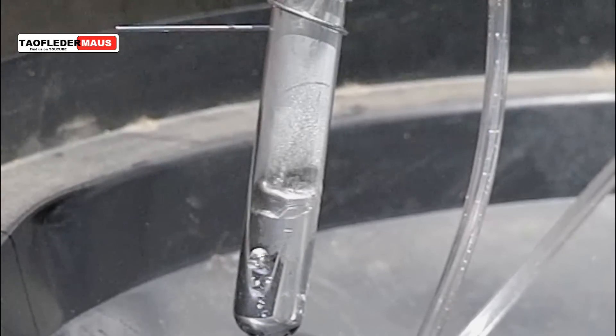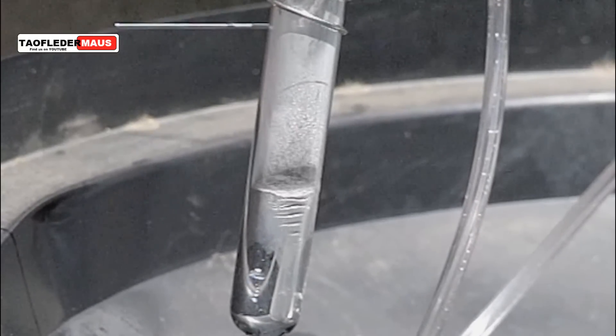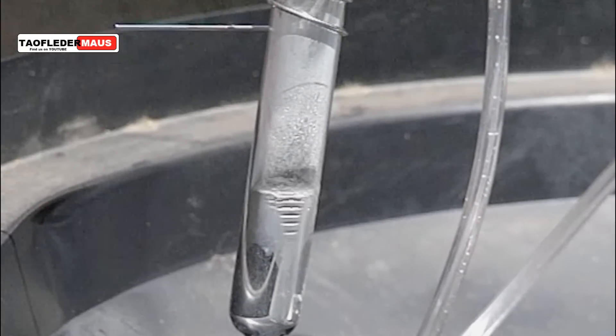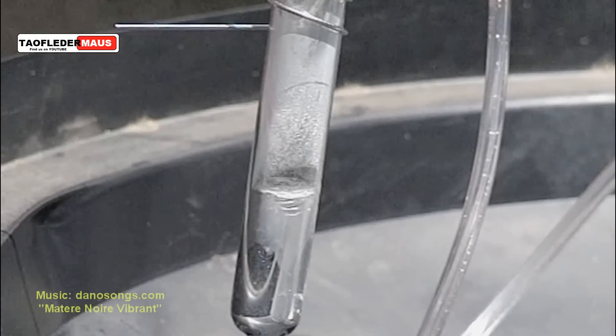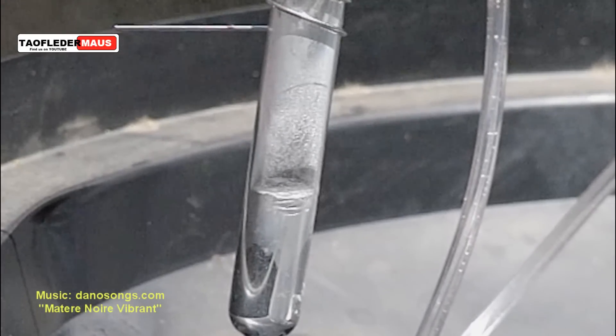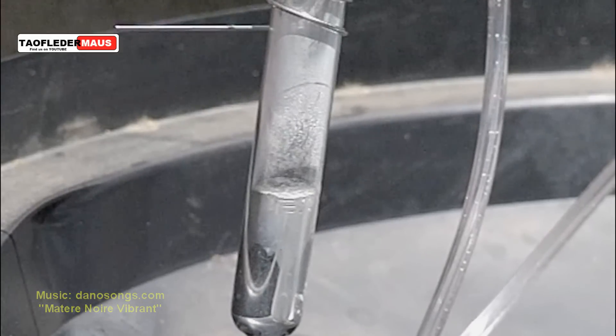The real pain is just decontaminating and cleaning up everything that the mercury came in contact with. I use a sulfur powder and activated charcoal mix, which neutralizes and absorbs any mercury that might be on the surface of anything.